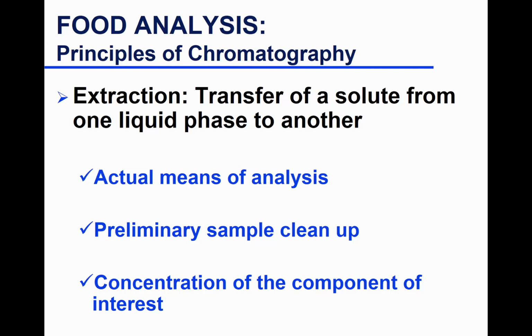Oftentimes in extraction you have two immiscible liquid phases, and the component that you're interested in will be more soluble in a particular solvent than the other. So you are extracting a component using a solvent that the component likes to interact with. So extraction can be used as an actual means of analysis. Can you think of an example where extraction is the means of analysis?